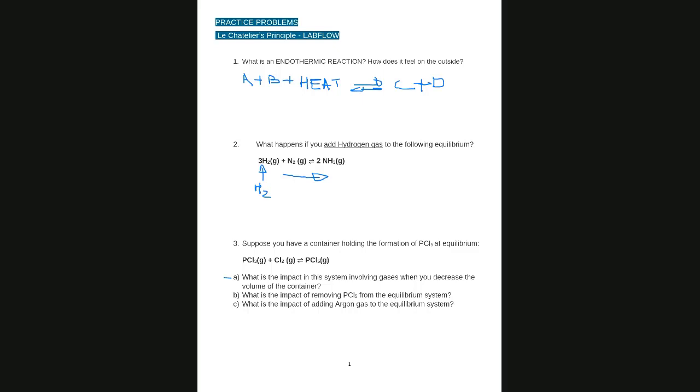In our case, when we decrease the volume, what happens to the pressure? The pressure increases. Yes, exactly. It's inverse. Thank you, Michael. When you decrease the volume and you have all gases, you know when you press, the pressure is higher.